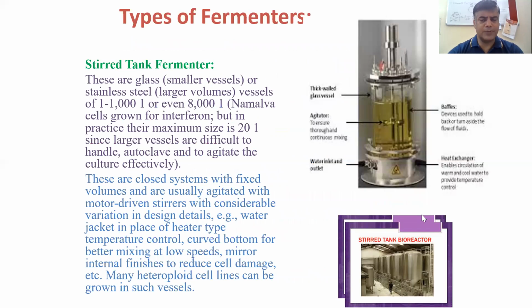There are several types of fermenters available in the market. The stirred tank fermenter is one. If you talk about the lab-based fermenter, there is a glass stirred tank fermenter with small vessels, and for the larger scale, there will be stainless steel, large-volume vessels.